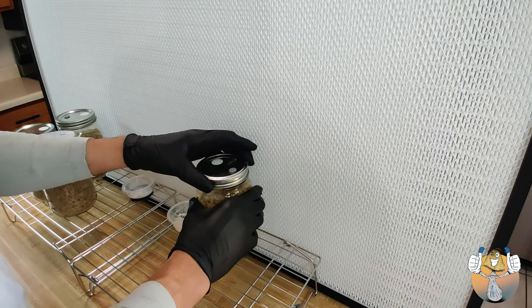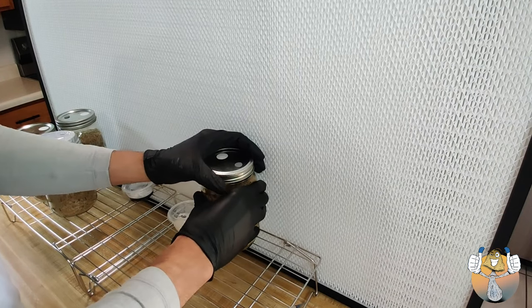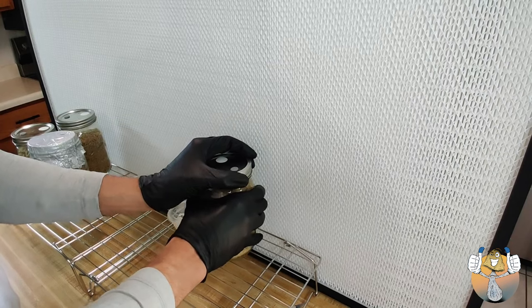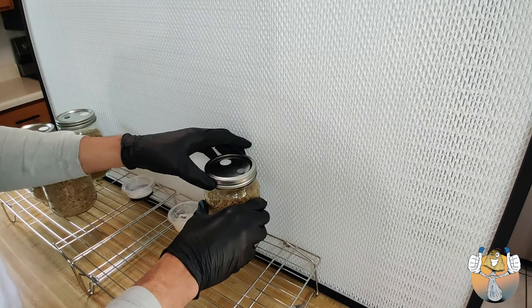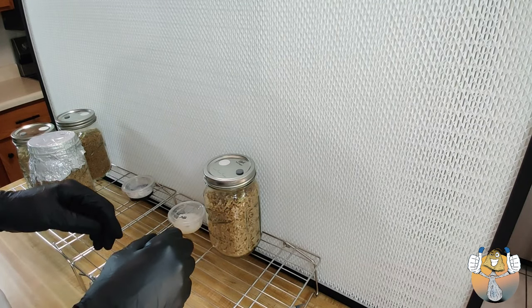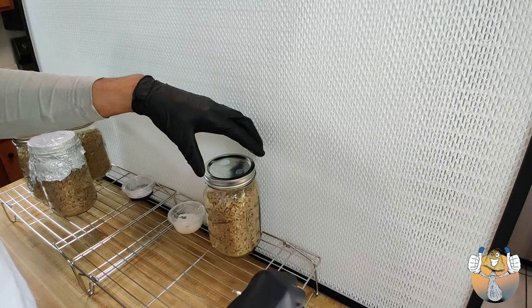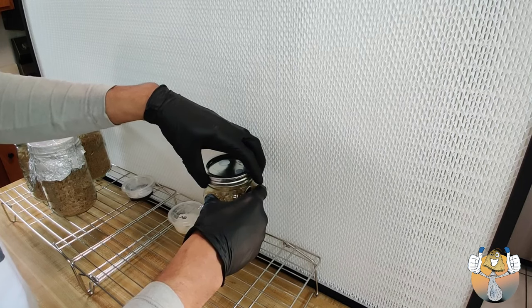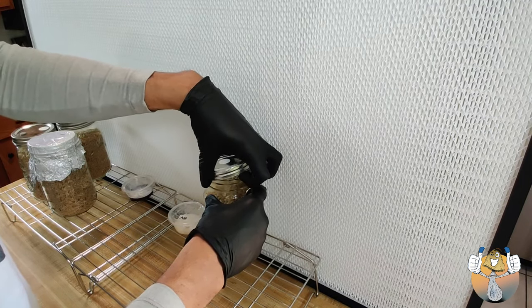I'll be lying if I tell you I wasn't nervous right now. I don't know why, but first time using the flow hood jitters, I guess. So while we have our scalpel cooling, just going to go ahead and pop the lid on our jar, and we're going to pop the lid on our agar cup as well.